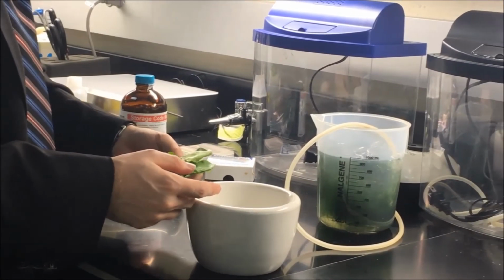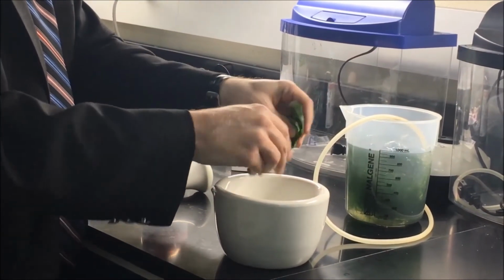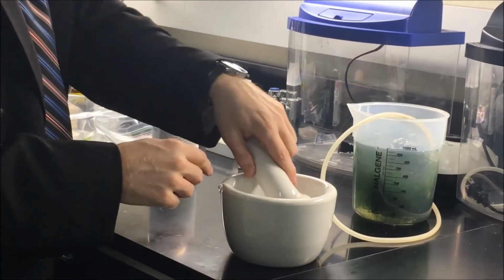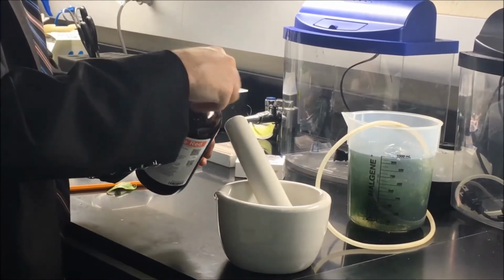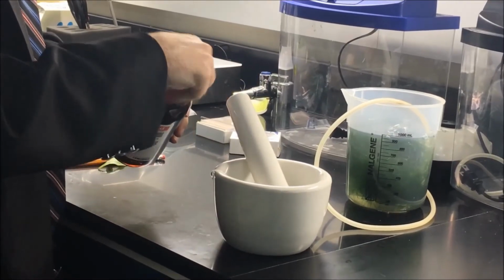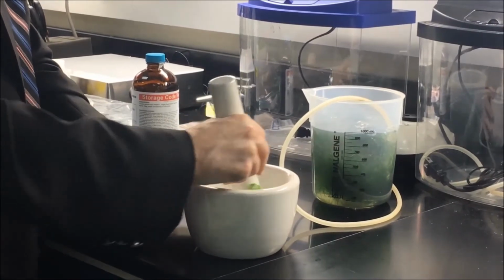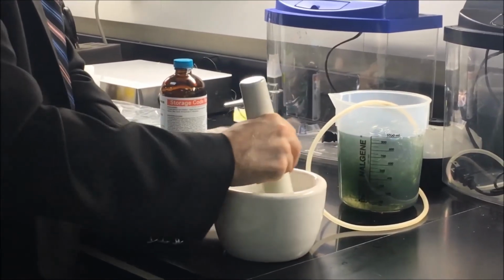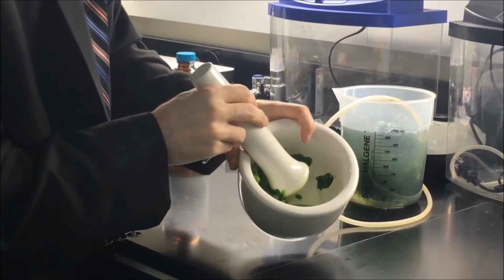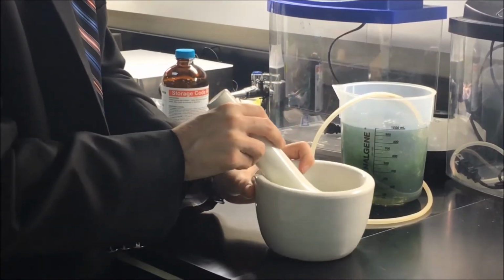To look at chromatography of the pigments in, say, spinach, we can take some baby spinach leaves and rip them up, add it to our mortar and pestle here, and then we can add a small amount of acetone. And acetone is going to help extract out the pigment that is in the spinach leaves. And then I'll begin grinding as such until I get some green liquid. That's my acetone with the pigments now extracted.